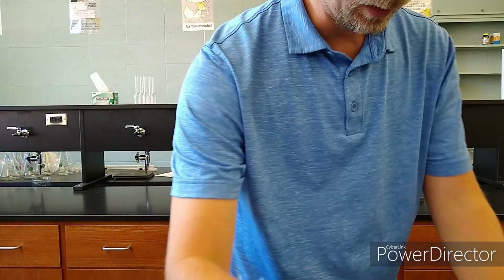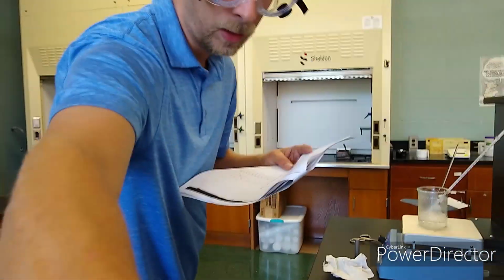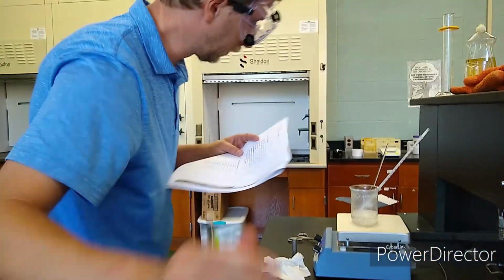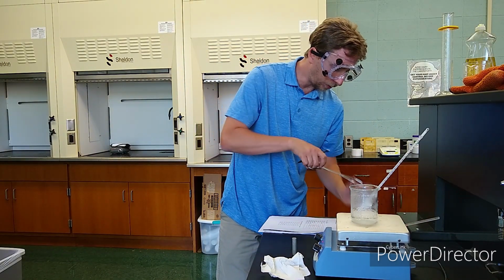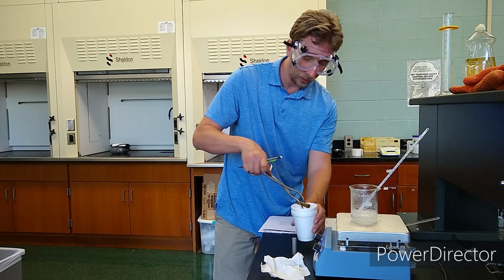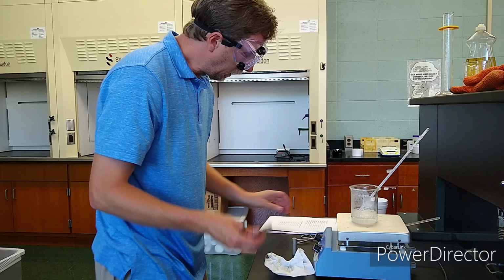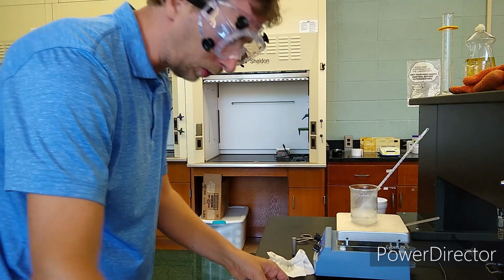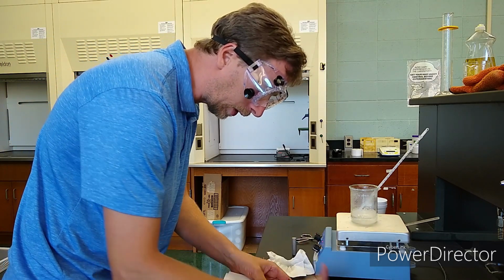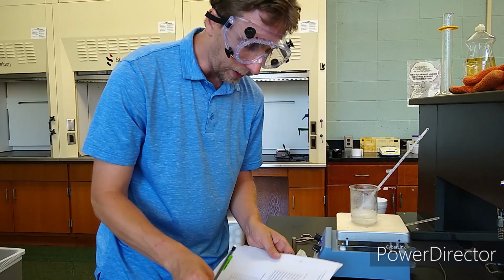Now on this set of data, this second metal that we did was brass. So we can write that down. Brass is practically, or very close to copper in terms of its specific heat values when you look them up on the table. But this is brass, okay? And so I'm going to write that on my data sheet so you won't forget, hopefully. Whenever you're doing your calculations, you'll know what to compare with for your percent error calculations.